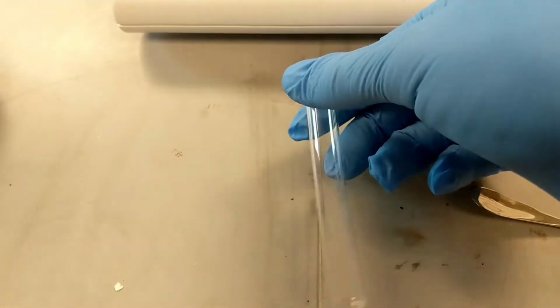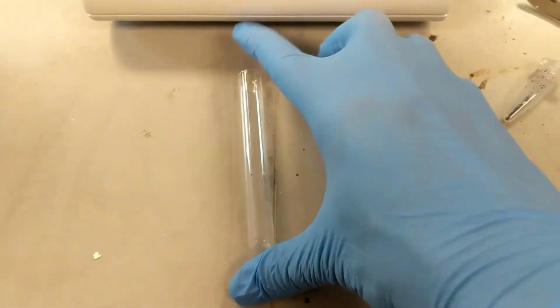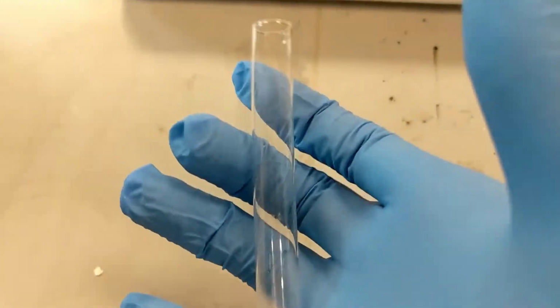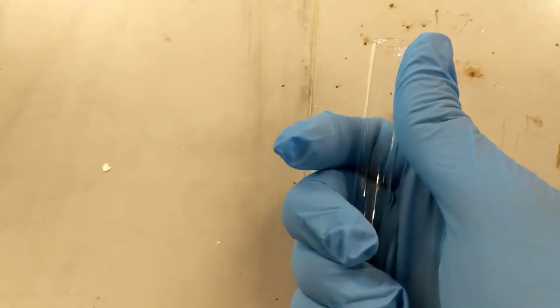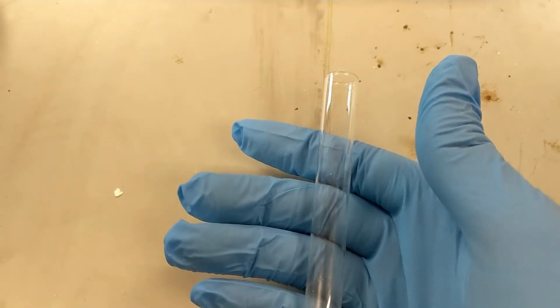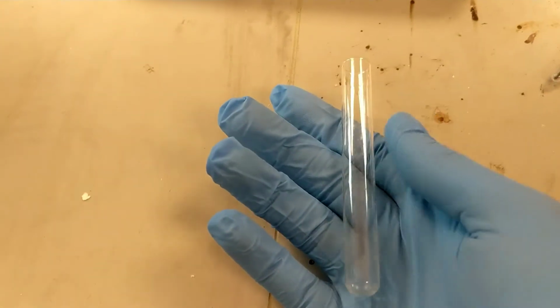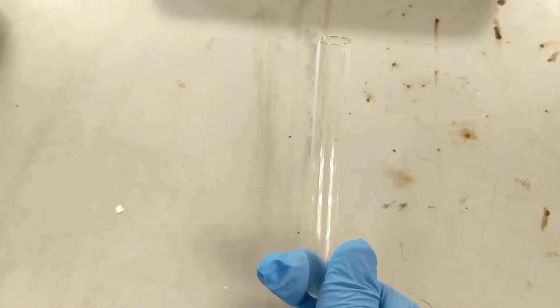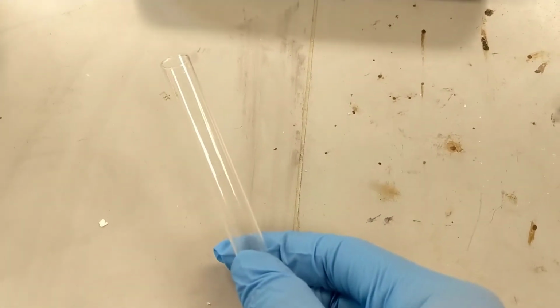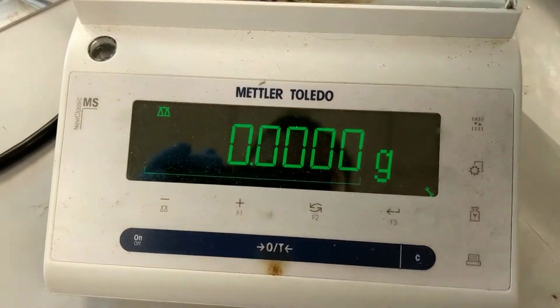Alright guys, this is the test tube after evaporation. As you can see, it doesn't look like there's anything in there. My prediction might have been wrong from the beginning. Because if you remember, succinic acid has 2 carboxylic acid groups, which means it would be highly soluble in water and not very soluble, if ever soluble, in an organic solvent like methylene chloride. But let's weigh it and see if there's anything at all in there.